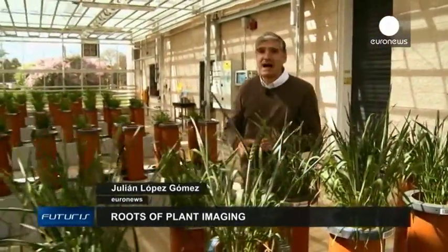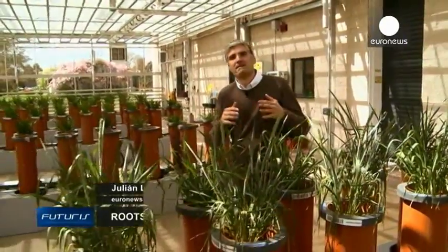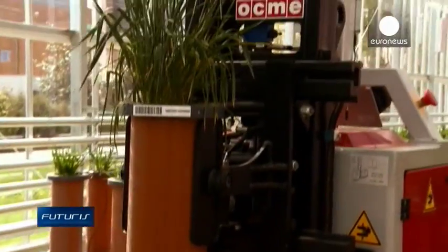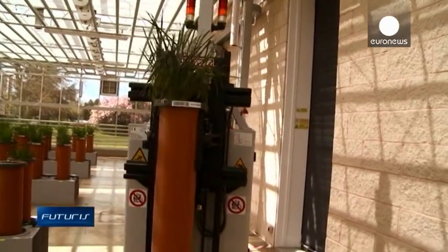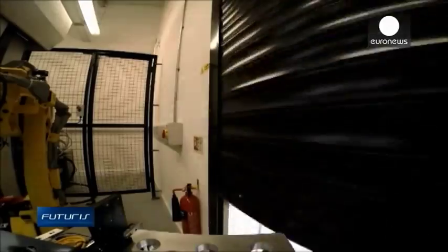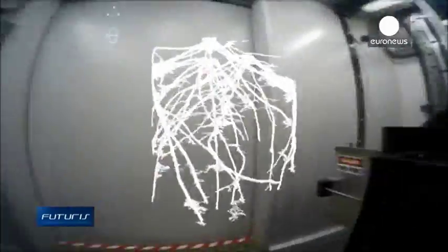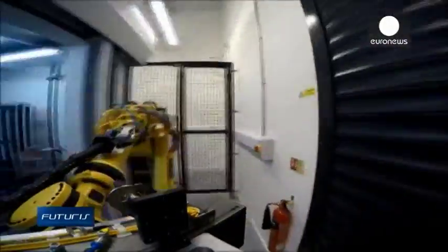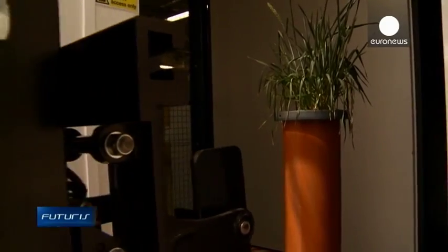How can we increase the ability of crop roots to locate and absorb water and nutrients? Follow this robot to find out. This robot is just part of a complex mechanism developed to reveal the secrets of wheat and other crops. Grown in soils with different nutrients and water contents, the wheat samples are taken to a huge CT scanner.